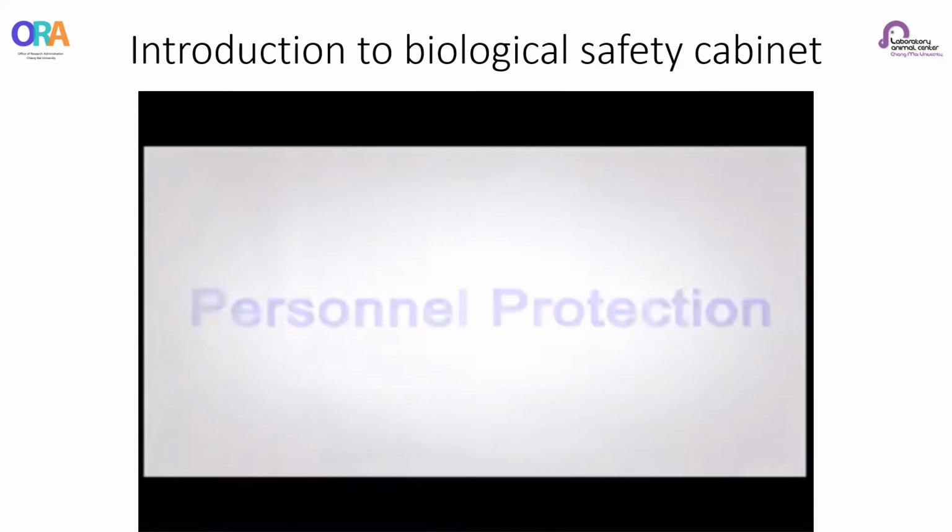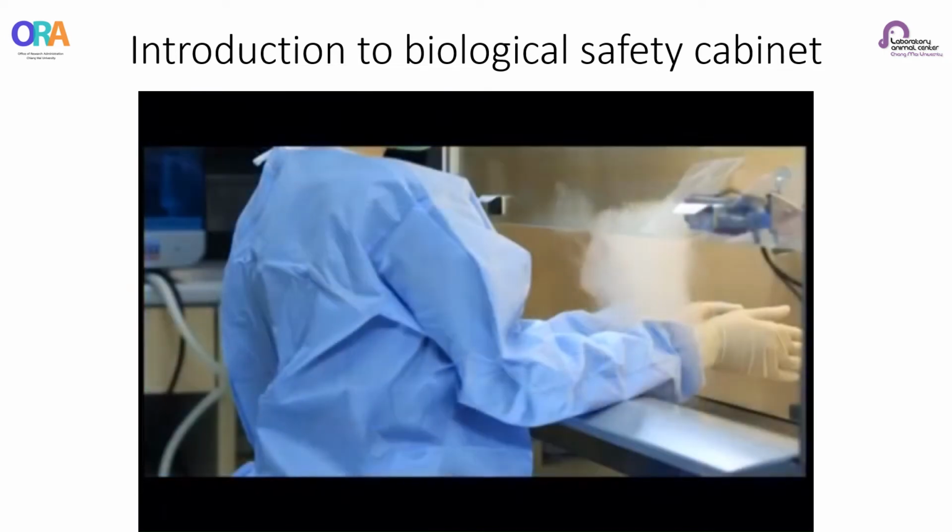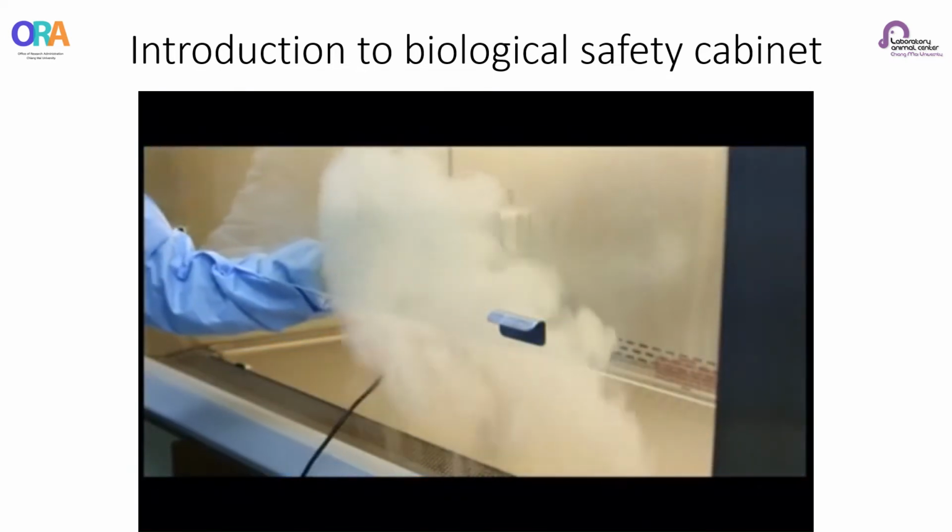Personnel protection. Airflow is drawn into the front grill as an air curtain, which, along with the sash, provides protection to personnel working in the laboratory.